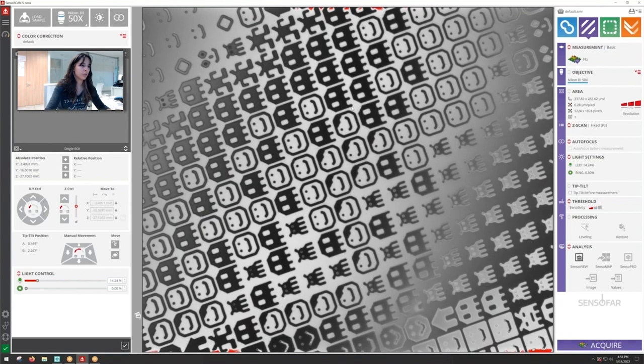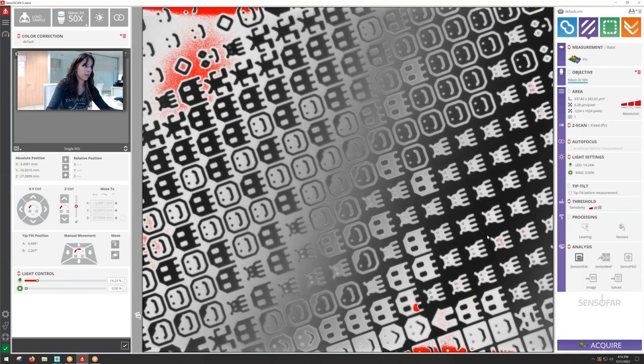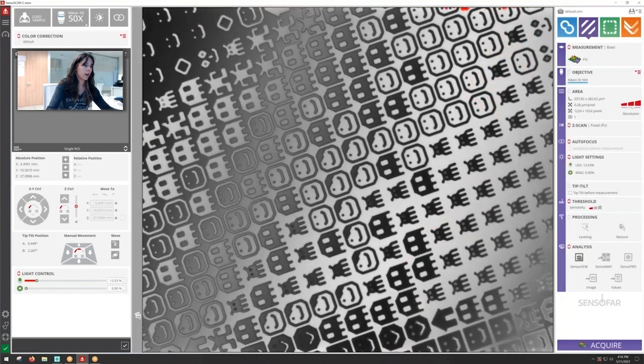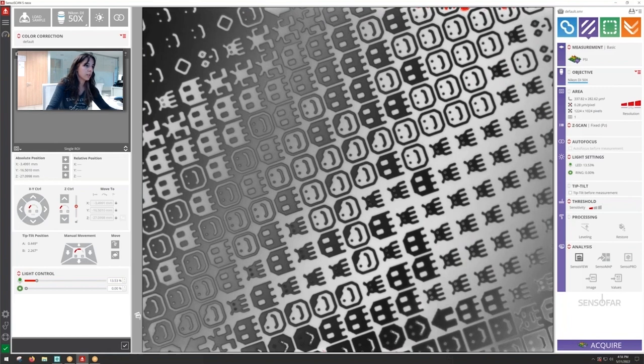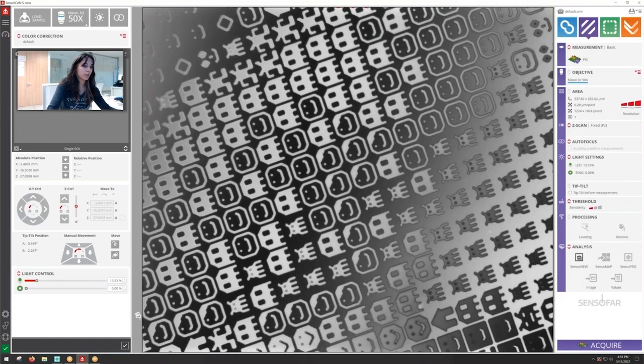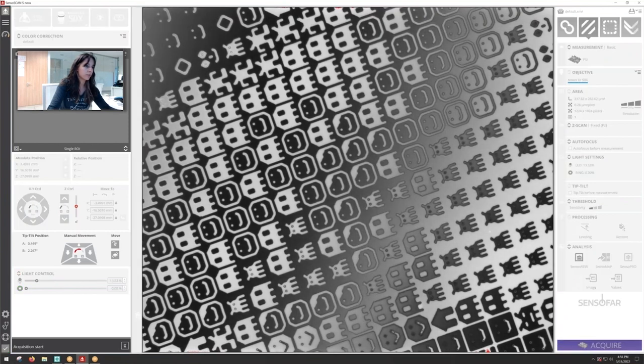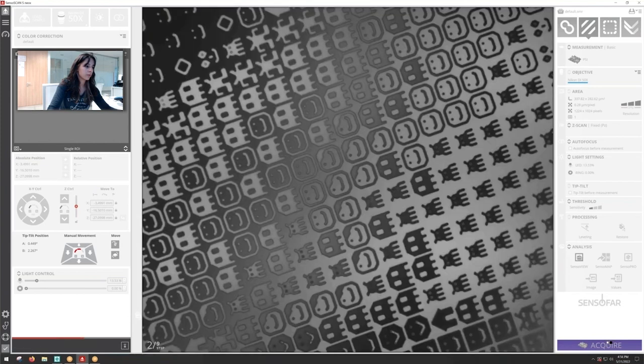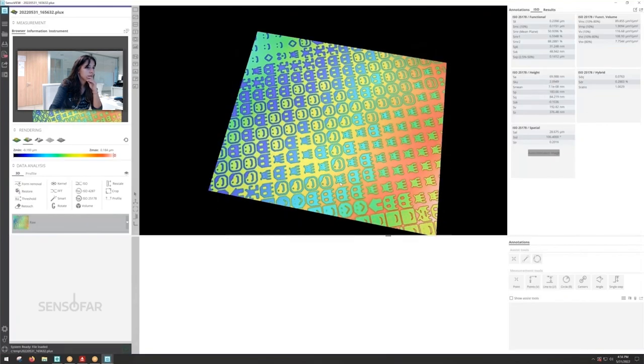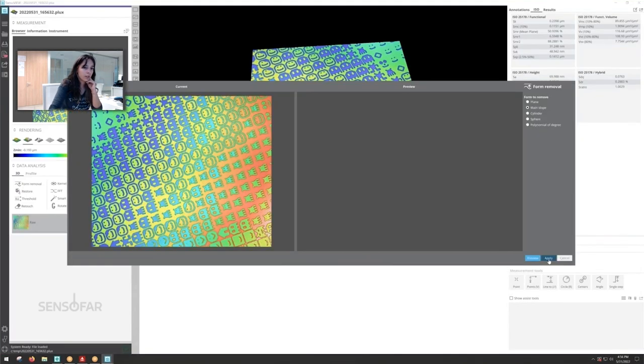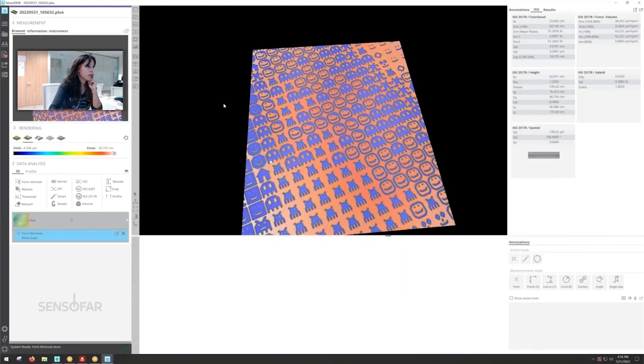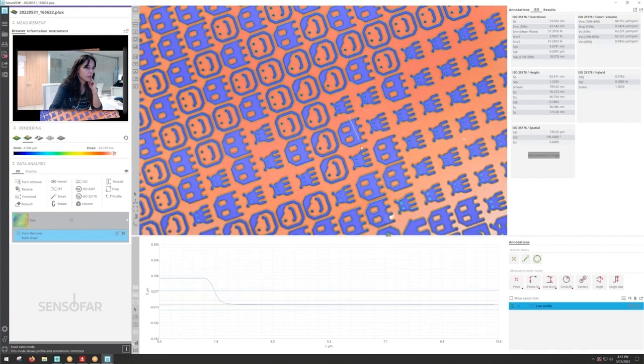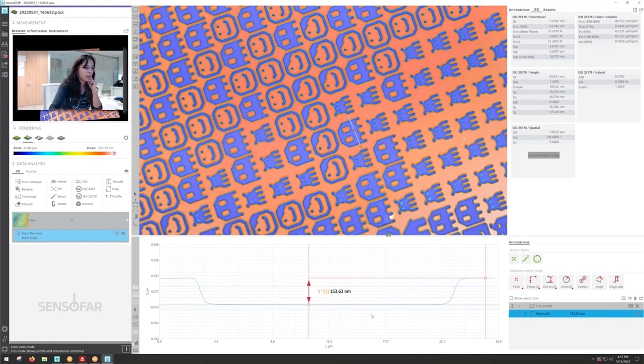We're going to measure this funny sample and if the step height between the bottom and the top is not higher than more or less 140 nanometers then it's going to measure it properly. So we are in focus and we can click acquire. It looks really nice. Let's remove the inclination and let's check out that step height that we can find on those funny features.